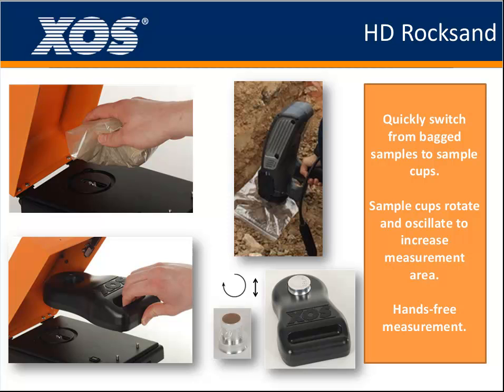And the last one, we call the quantitative analysis mode. We put a soil sample or wastewater sample into the sample cup and put the sample cup on the rotator platform, then put it into the sample chamber, close the cover and test. For this one, it can give a quantitative analysis range, and with the help of the rotator we can analyze a much larger area of the sample, which means we can compensate for some unhomogeneous distribution of heavy metals in the sample.